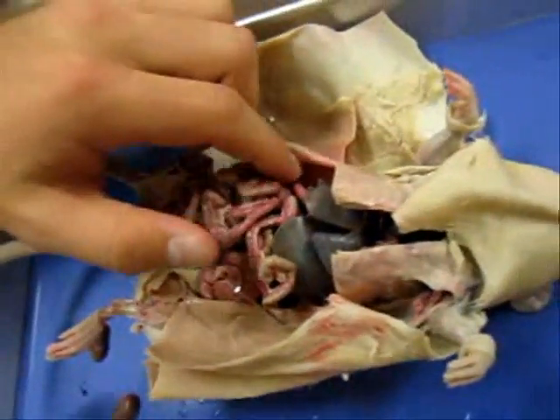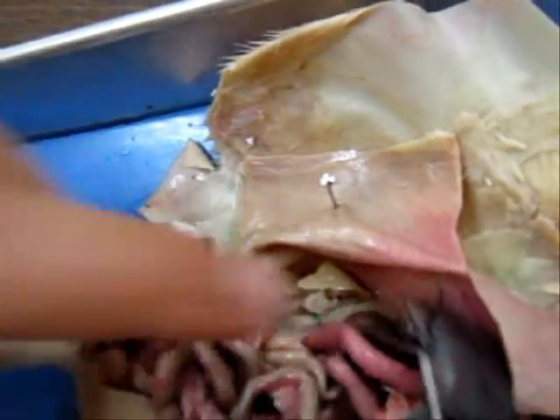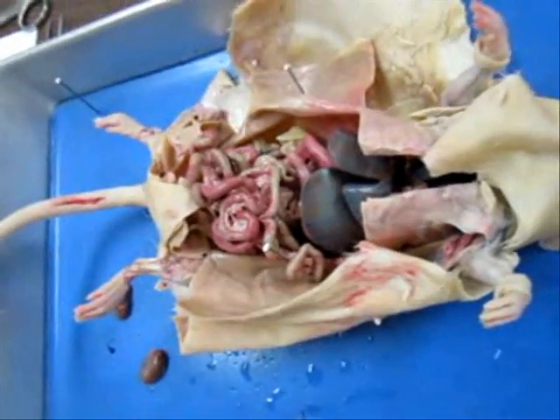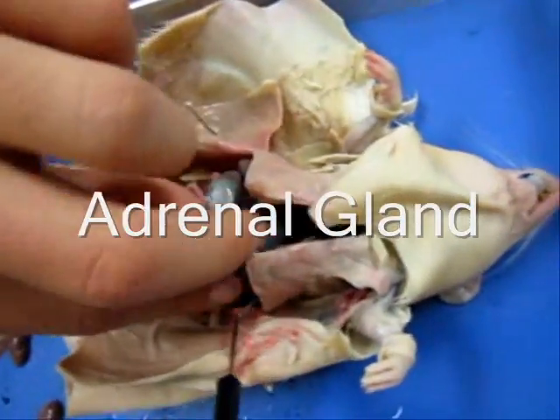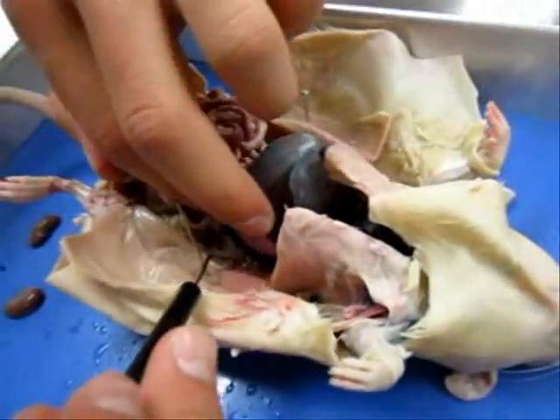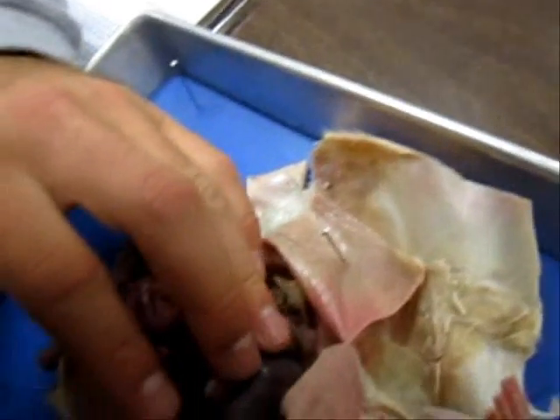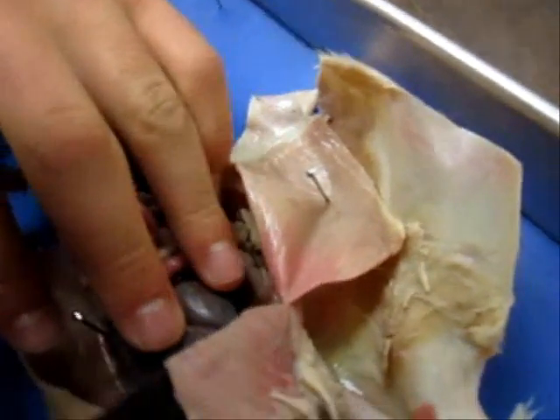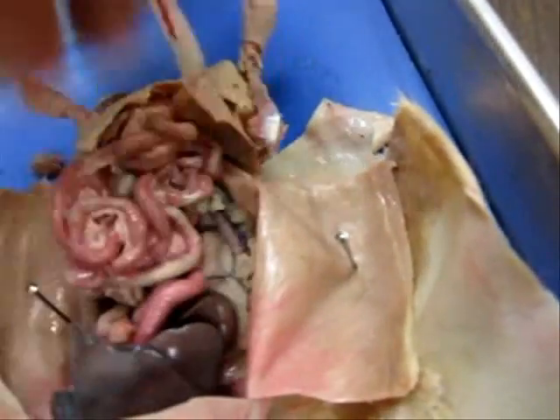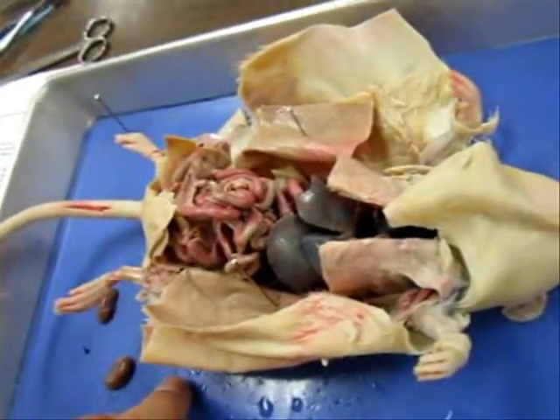There's another kidney on this side, just to show you they're both in the same spot, right next to the liver. There's an adrenal gland right above it. It's really tough to see. I'll show you on the one that has it. Here you go, look over here. See the kidney right here? The red on the top, that's the adrenal gland, and that sends out adrenaline to the body when needed.